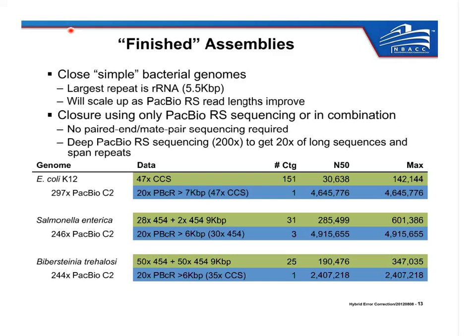Again, as I mentioned before, if the PacBio read length doubled tomorrow, you would only need to have 100x if it maintains the same distribution to get to this closed recipe. So again, it automatically scales up as the PacBio technology improves and the read lengths keep improving. You get automatic benefit without having to do new development.